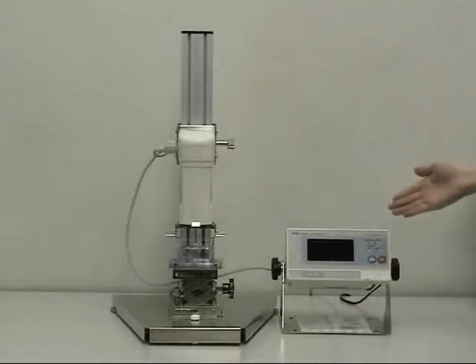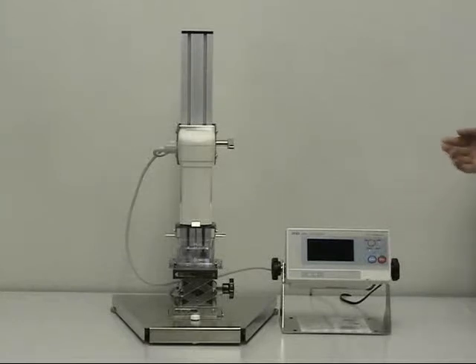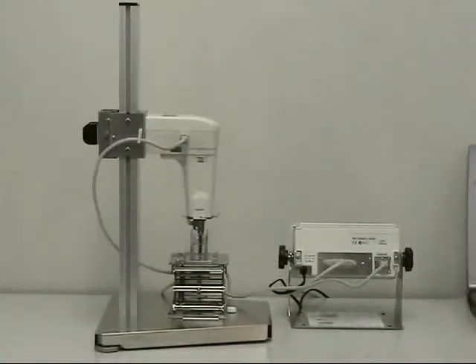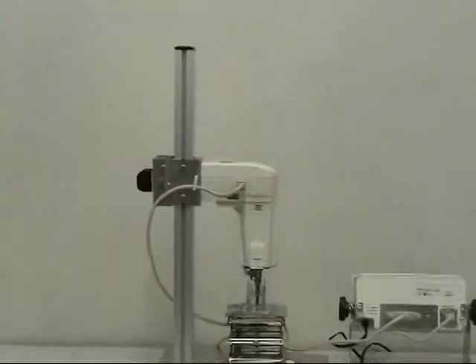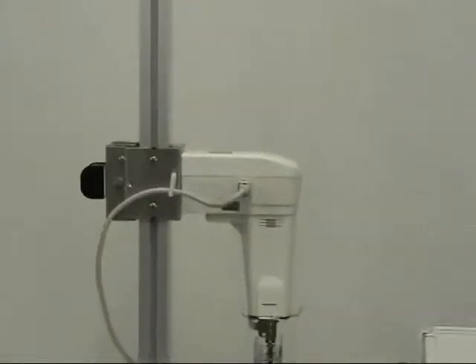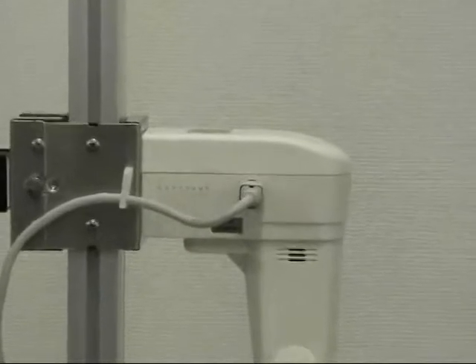SV10 is composed of a main unit and a display unit. The main unit and the display unit are connected by a connection cable. The main unit and the display unit have been adjusted as one set.